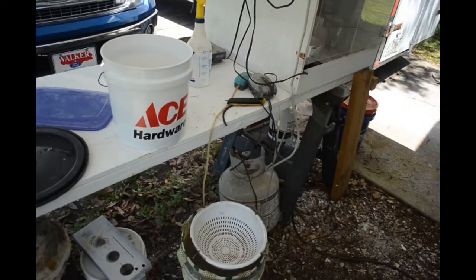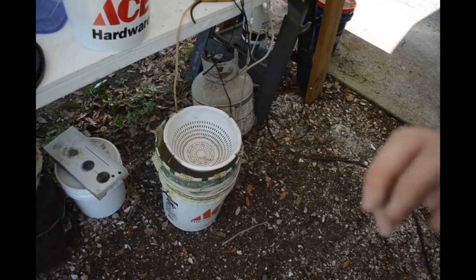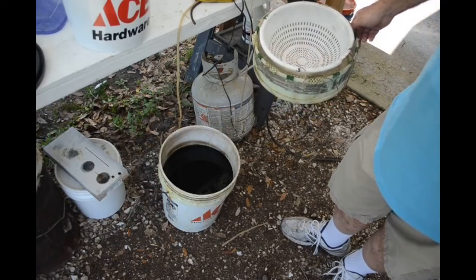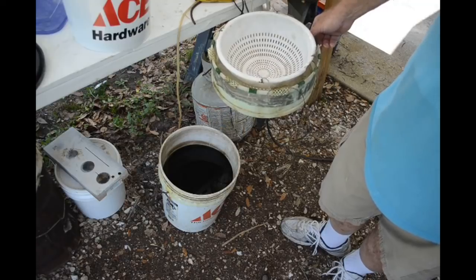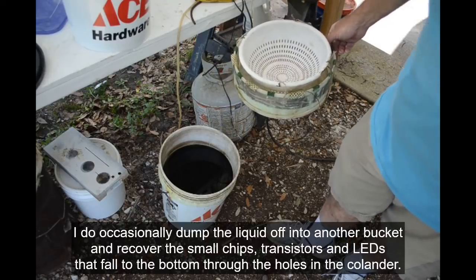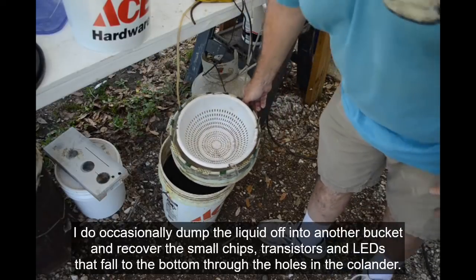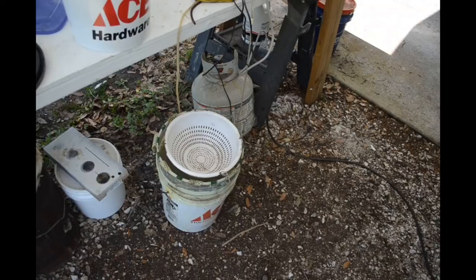Down here I've got a five-gallon bucket mostly full of AP solution, and I've been soaking IC chips in there for probably close to two years now. It just keeps working — when the level gets a little low due to evaporation, I just add some more muriatic acid to it. Let me glove up and we'll put some chips in here. I'll show you how I do it and get them dissolving.